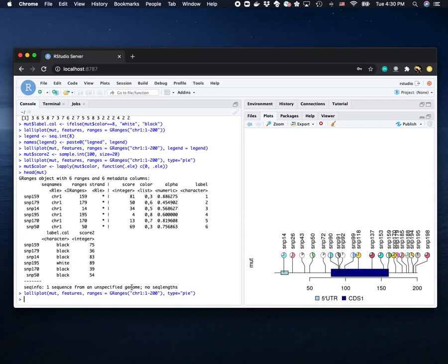If we want to change the plot to something like a caterpillar layout, we just add SNP side ID. The SNP side must be top or bottom.